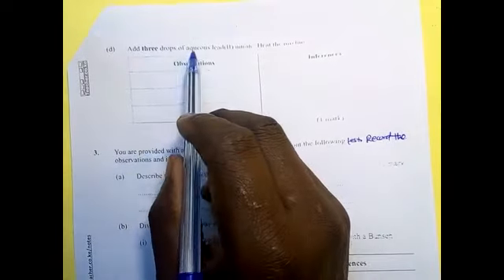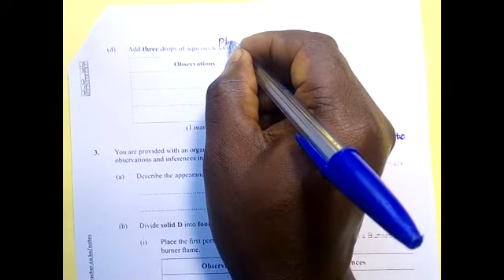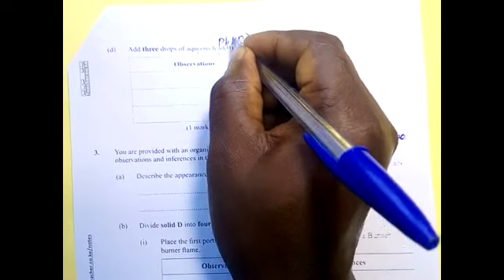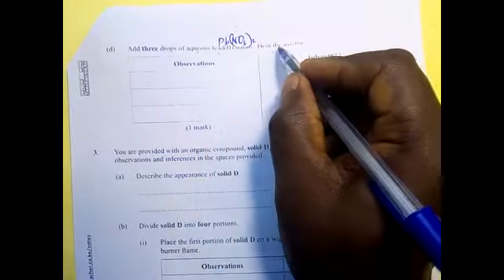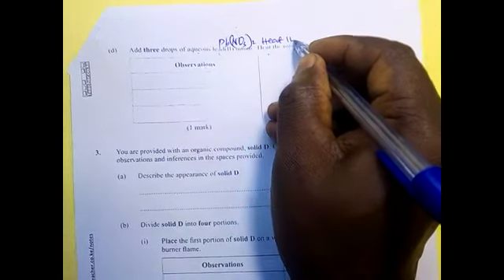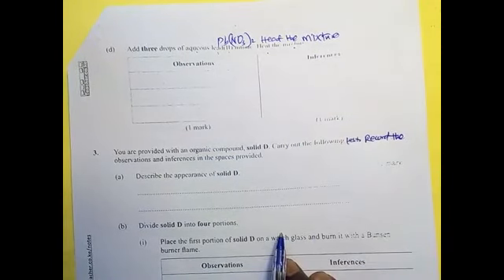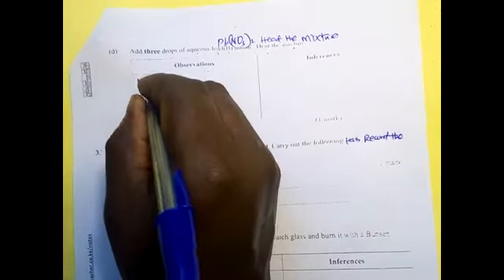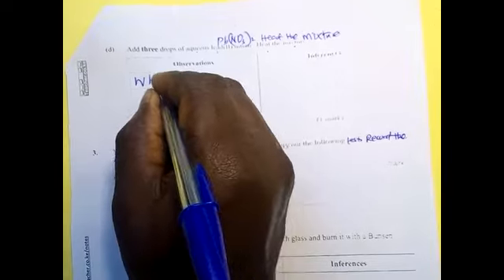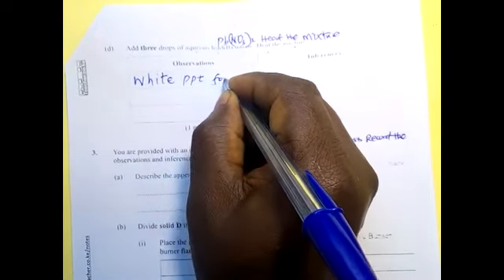Add 3 drops of aqueous lead 2 nitrate. Heat the mixture. We have been asked to heat the mixture. Then this is the observation: a white precipitate, white PPT, formed.